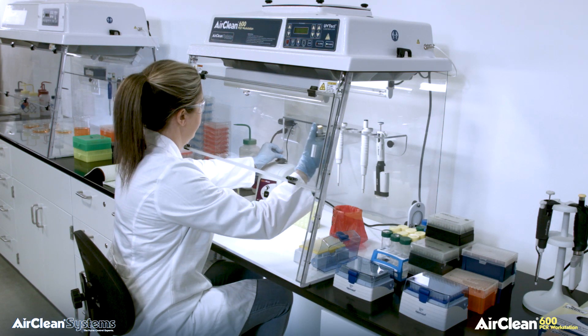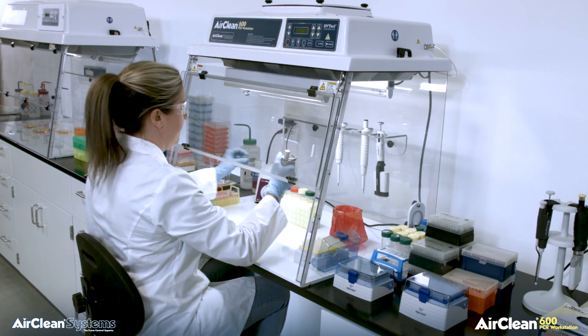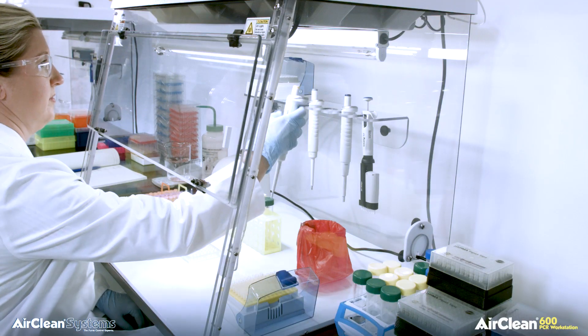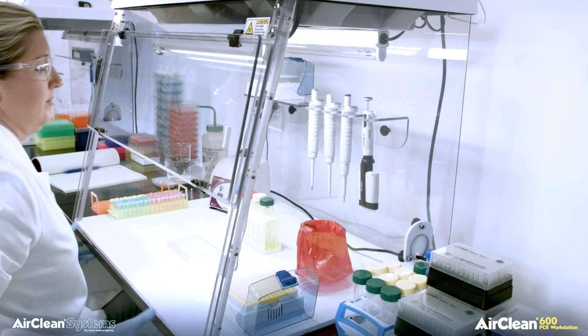The Combination PCR workstations are designed and constructed with the application and operator in mind. The application requires the use of shortwave UV energy to sterilize the workspace between amplifications.